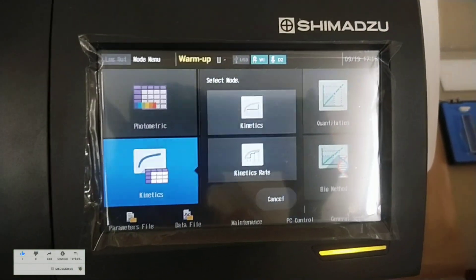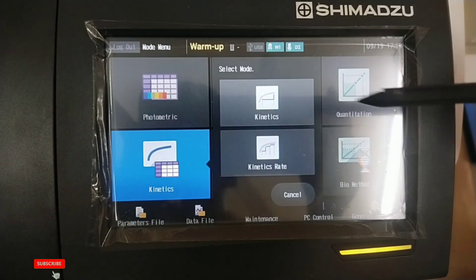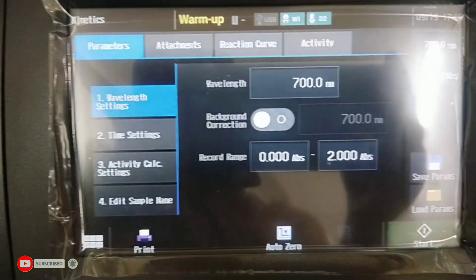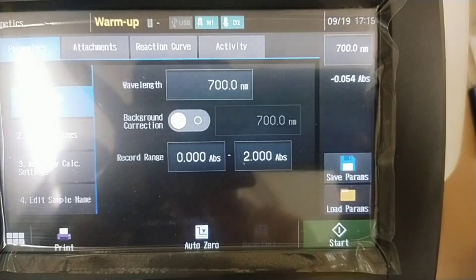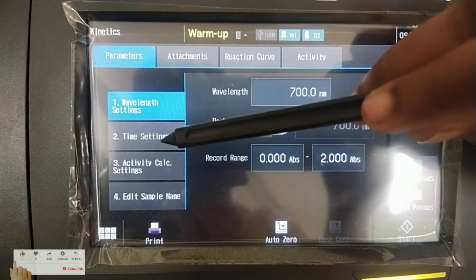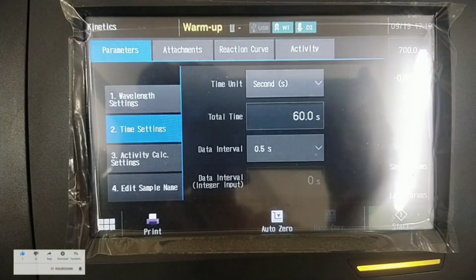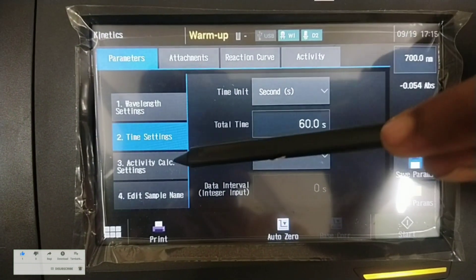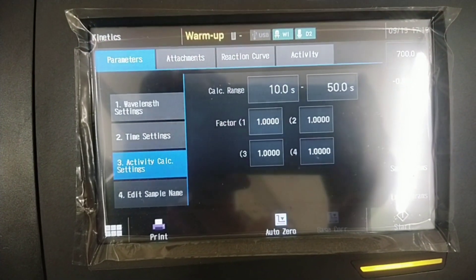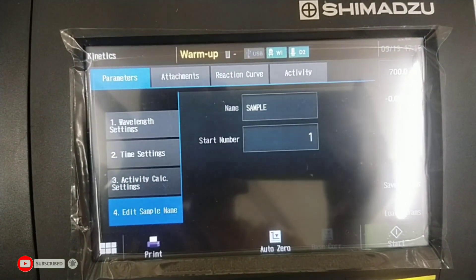You can observe wavelength settings, time settings, activity calculation settings, and sample name settings. The kinetic mode allows you to measure the changes in absorbance which occur from enzyme reactions and to obtain the activity value of the enzyme. You can observe the modes and settings.